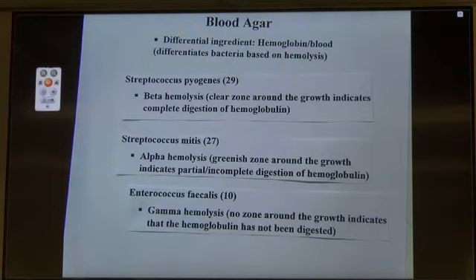Are there any questions on any of the plates? Yes? On the mannitol salt agar, you had 29 and 11. Do you have a paper by any chance for the definition that you have? Later.